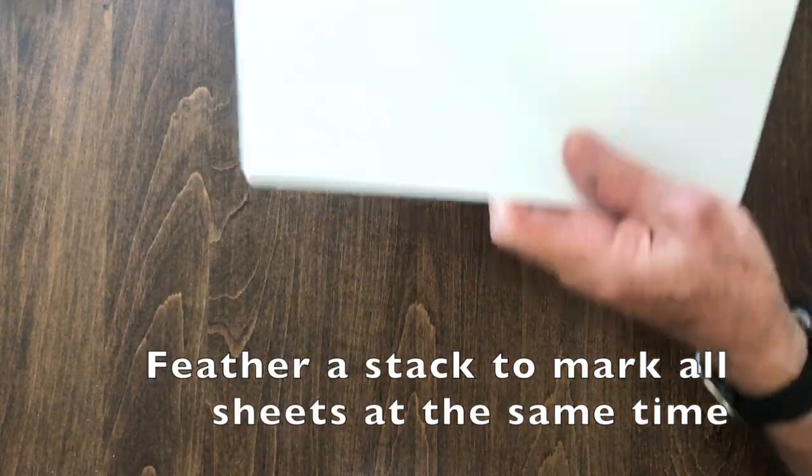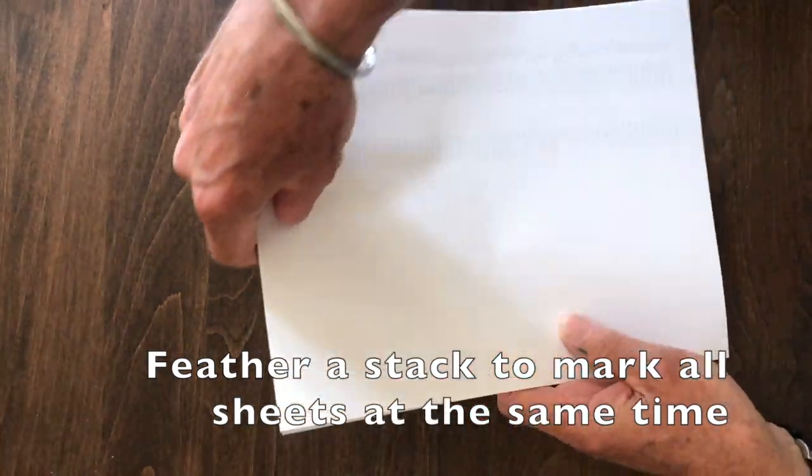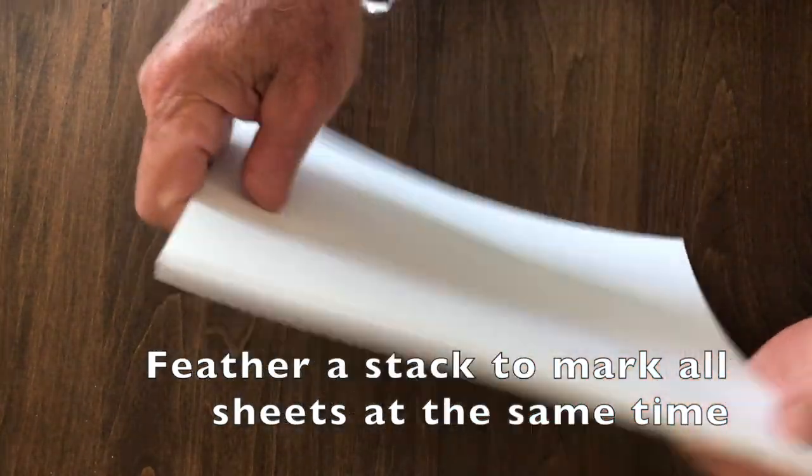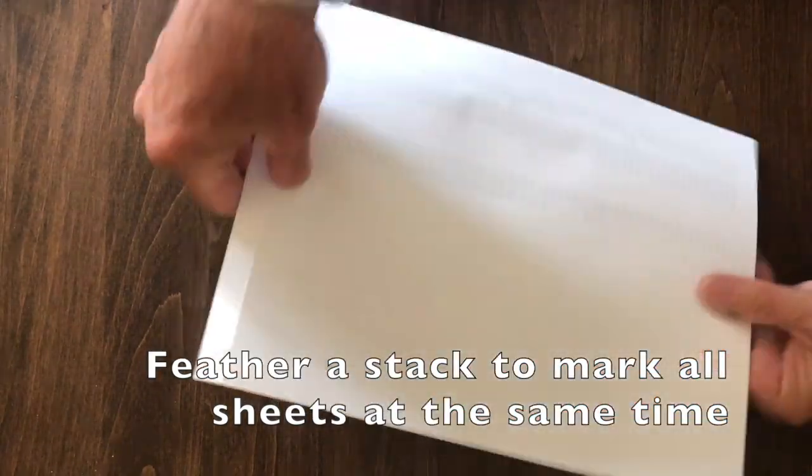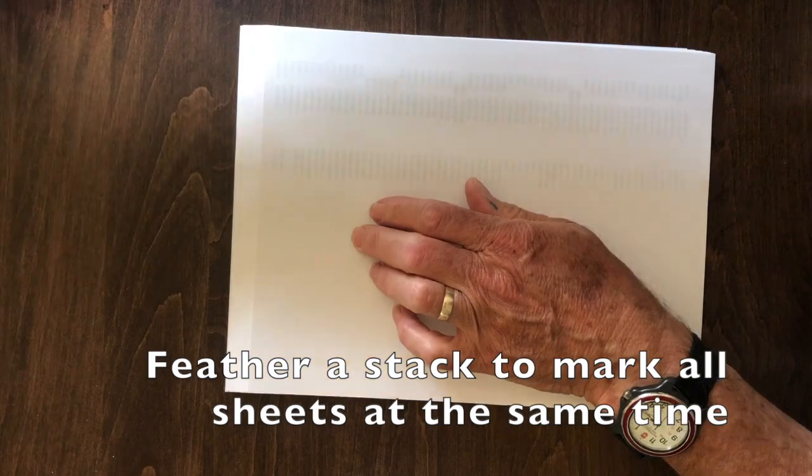Now if you want to do several of them, there is a trick: feather the paper and make it even like that, and then take the card.